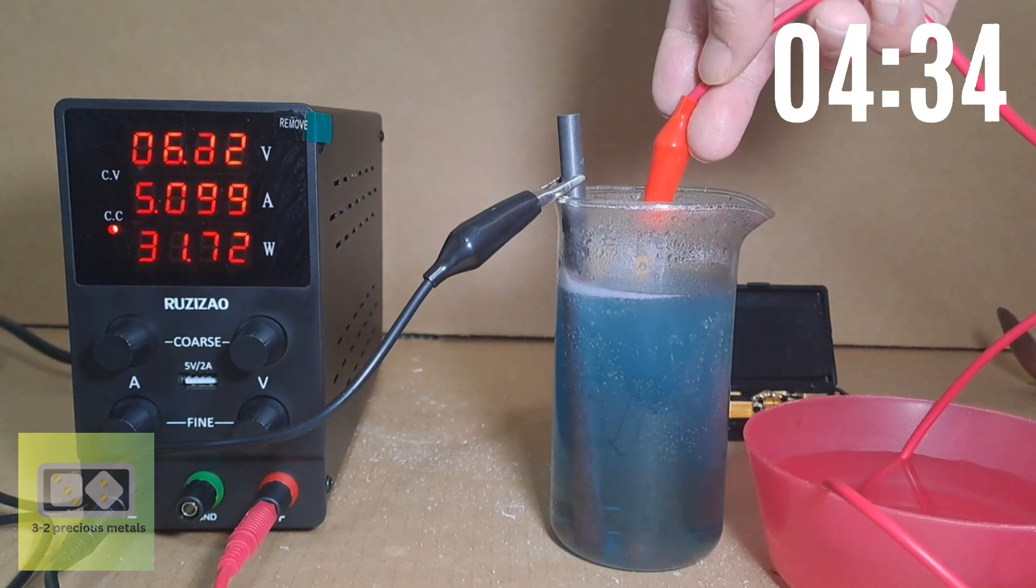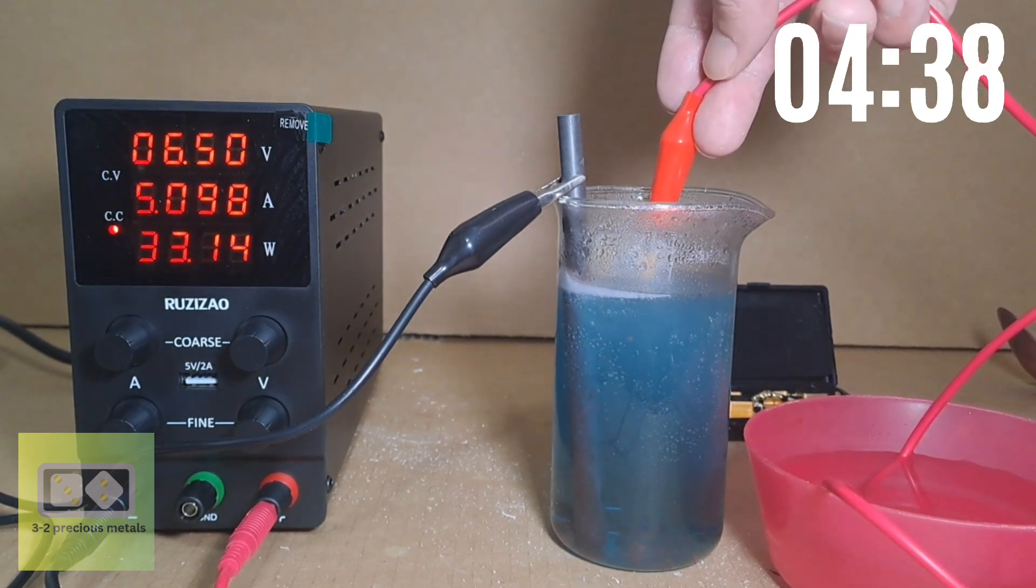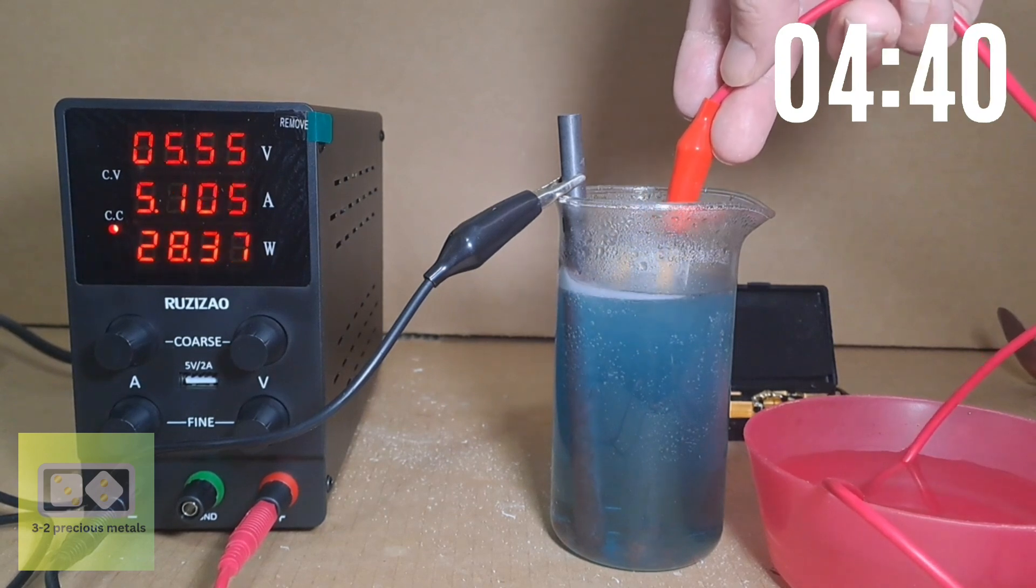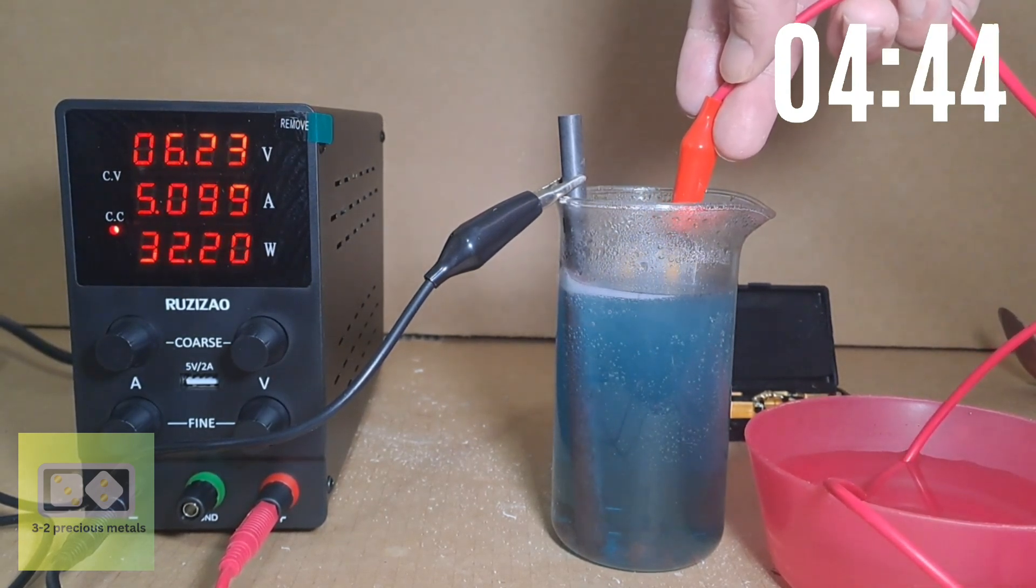When I've seen this process done with concentrated sulfuric acid, I've noticed there is a lot less bubbling. The solution doesn't turn blue and copper doesn't deposit so much at the cathode.